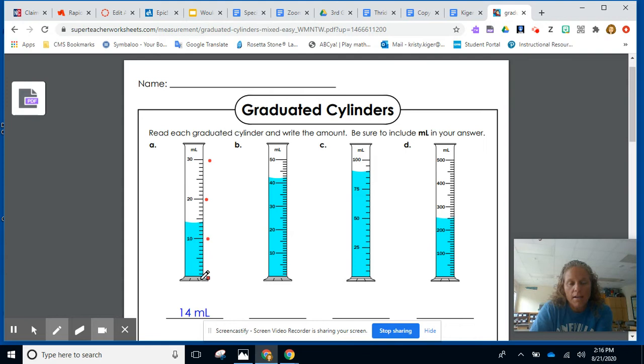One, two, three, four, five is right in the middle, six, seven, eight, nine, 10. So this one happens, these little lines happen to be counting by ones. So when I look at where the line is, and sometimes water when we see it, it kind of has this little curve to it. So I'm at 10 here, 11, 12, 13, 14 milliliters. We usually measure liquids in milliliters or liters when we're using the metric system. So you can see the answer down here.